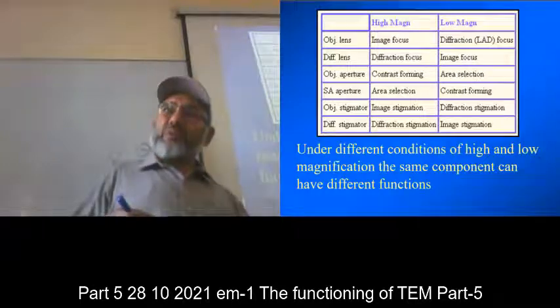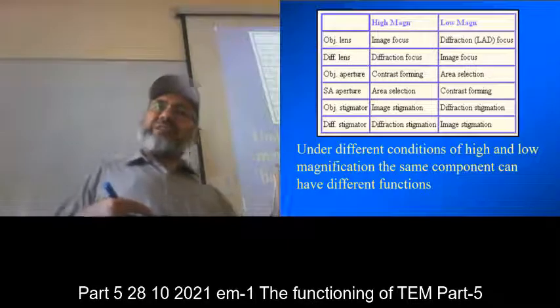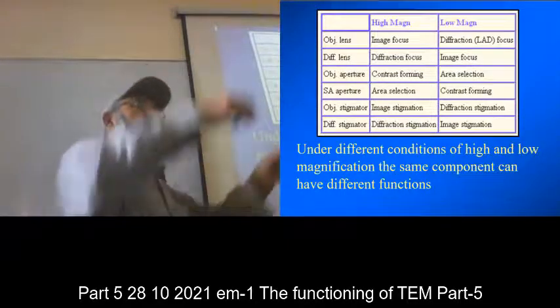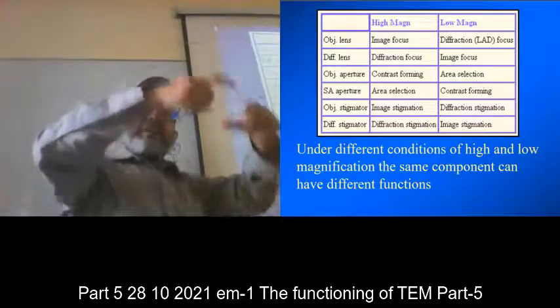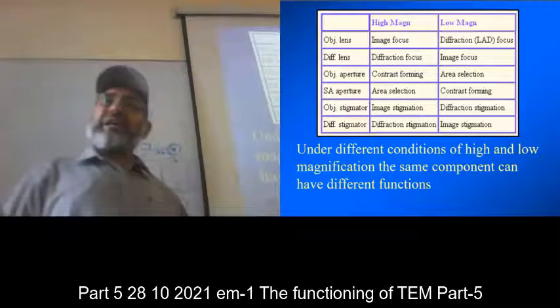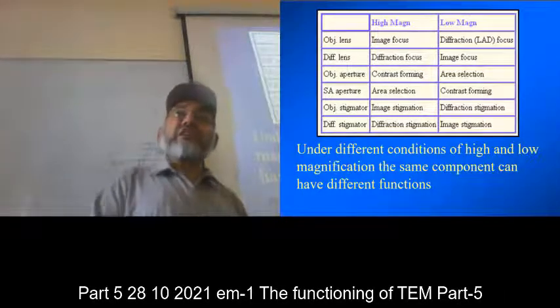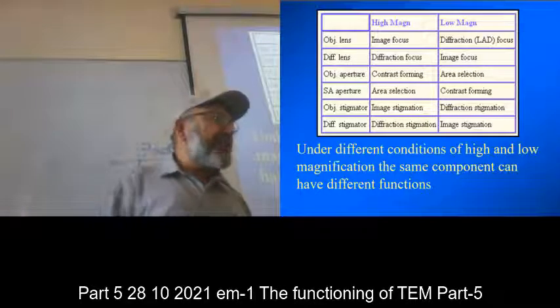proper in those parts. And that selected area diffraction aperture is used so that all the other beams coming are excluded, and only the ones falling upon the relevant crystal and then coming out of that crystal are selected, and you get highly interpretable, visible and resolvable diffraction spots on the imaging screen.